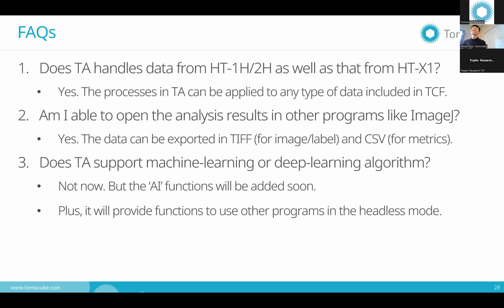The difference is that in most optical microscopes, for each pixel, they get the direct information from the optical measurement. In our case, from the direct measurements, we recompute the RI values for that particular voxel. So that's the most different part.